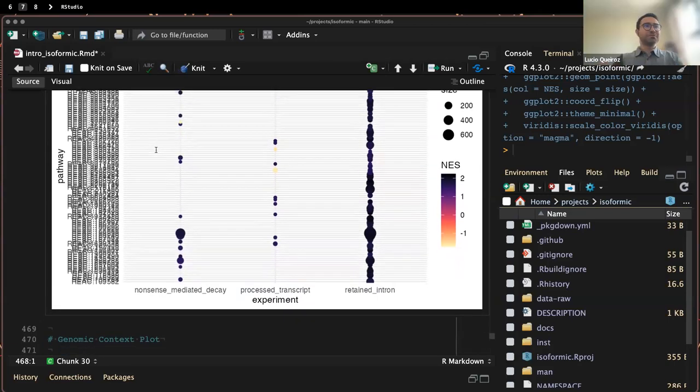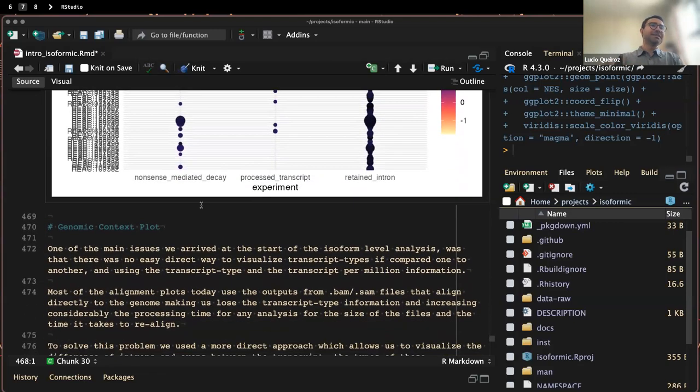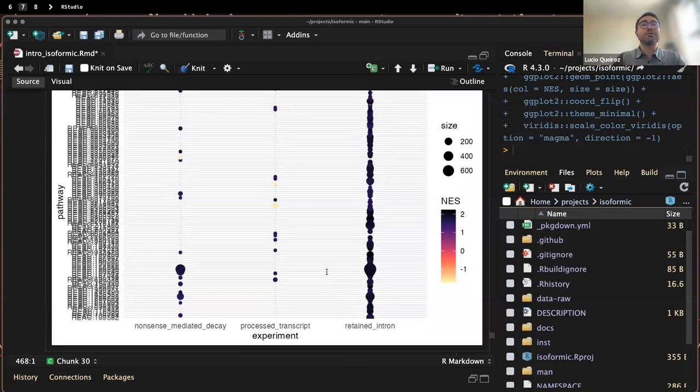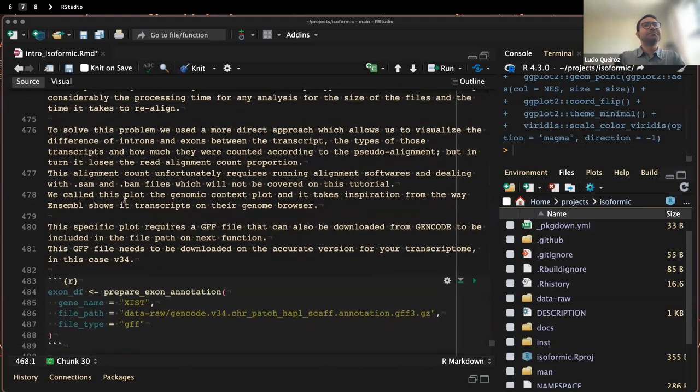Okay, that's a good example. So yeah, in the end, it can help you derive some biology or, like I said, actually find novel biomarkers. For example, if your study is related to finding biomarkers for a specific disease or for specific phenotypes, this could help you see that it's not really just the gene or just the protein that could be a biomarker. The non-coding transcriptome, the non-coding isoforms can actually help you understand that biology and find new markers for that phenotype you study.